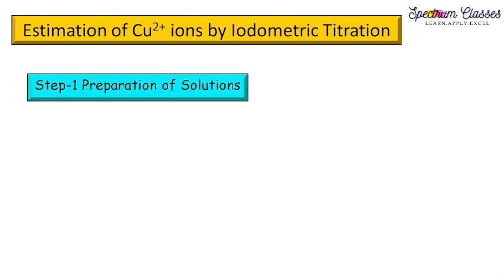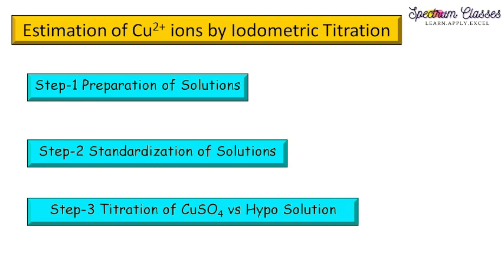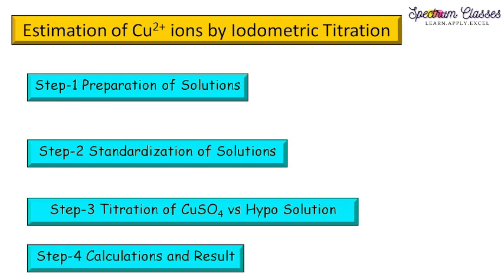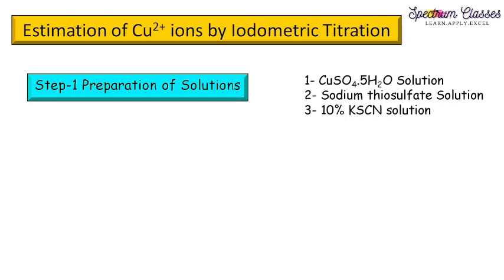This video is divided into four different steps. First is preparation of solution, second is standardization of solution, third is titration of copper sulfate versus sodium thiosulfate solution (hypo solution), and the fourth step is calculations and results. In the first step, preparation of solution, we are going to prepare copper sulfate solution.